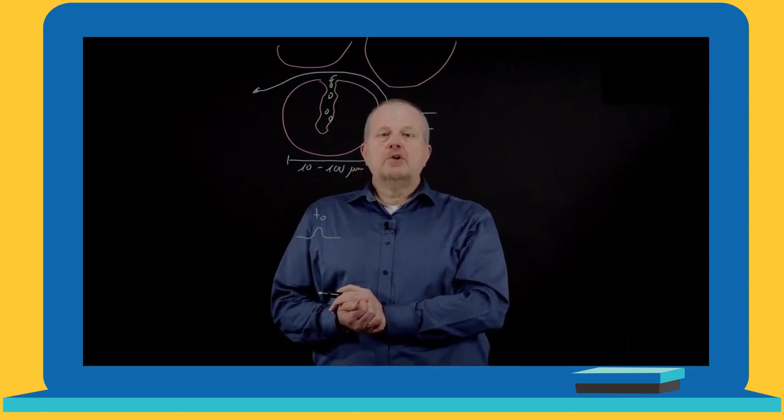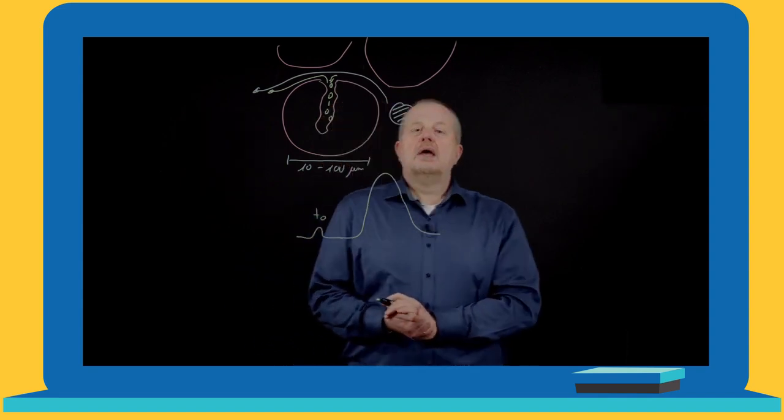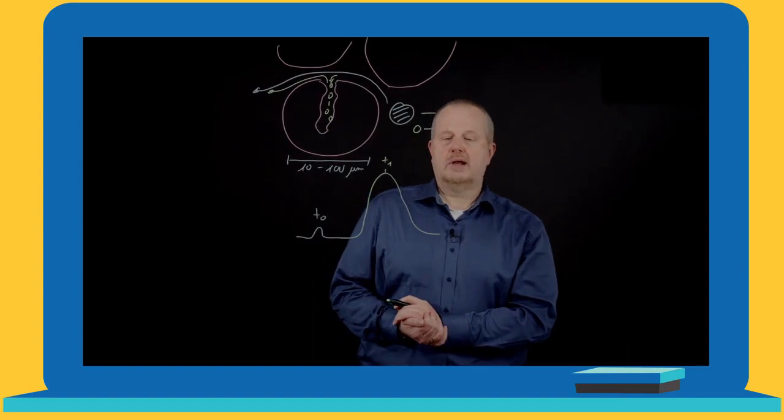And then we have the discriminating part between the separation of different compounds: the adsorption of one of our compounds to the surface area. When we change the mobile phase, or after a certain amount of mobile phase has passed through the column, we have the desorption of our compound again, and it is transported by diffusion back to the outlet of the particle and then transported out of the column. At that point, we see this compound coming out and we can detect it. We already know that this is the retention time of this compound, t1.